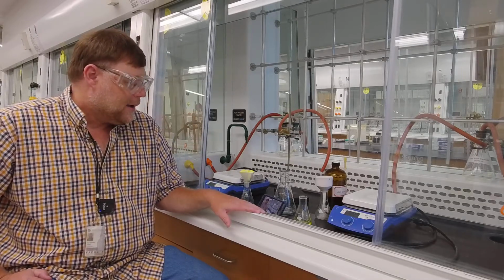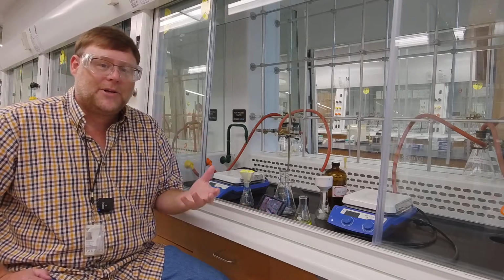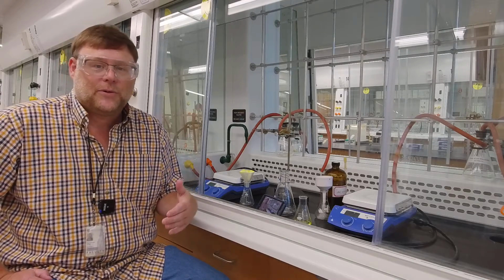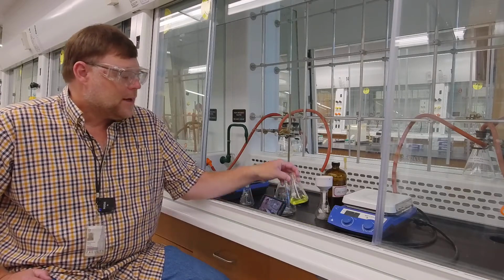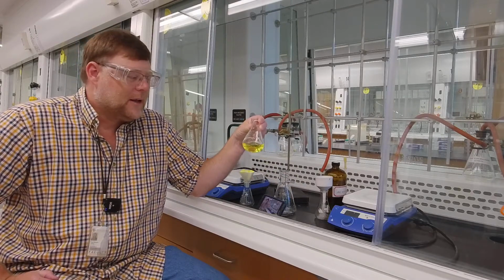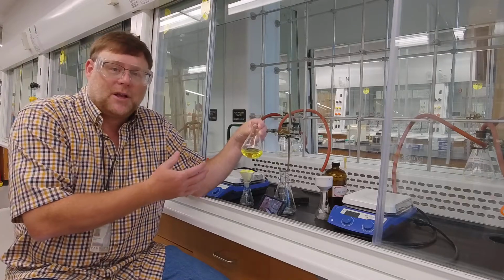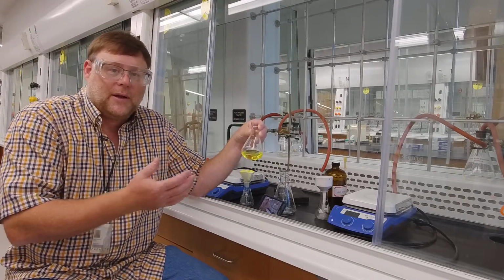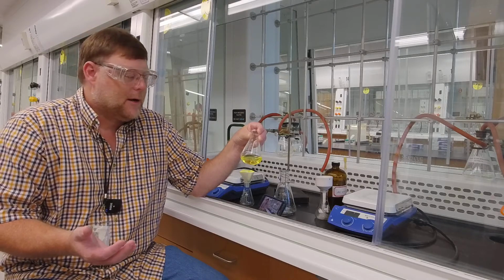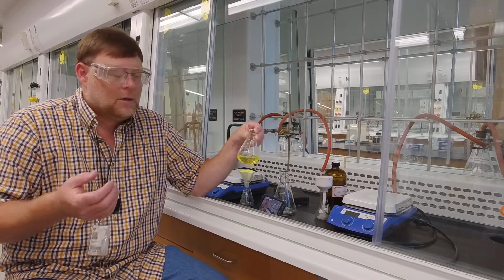So we're going to use organic solvents, and we have an advantage here in that organic solvents very often boil at relatively low temperatures. So the way we're going to separate the solvent from whatever is dissolved in it is by distillation. We're going to boil away the low boiling solvent. We're going to leave behind a non-volatile compound. That non-volatile compound could be a liquid that has a very high boiling point. It could be a solid.